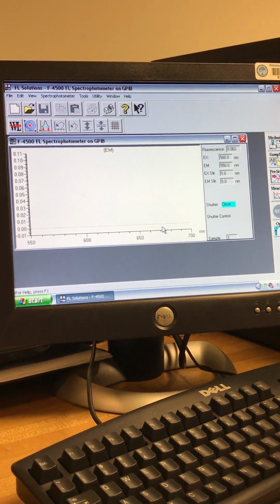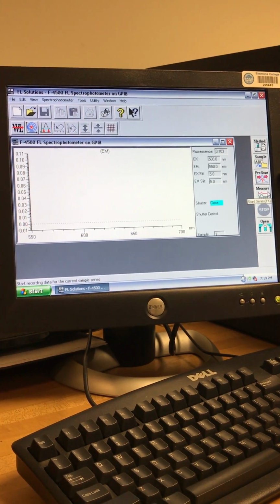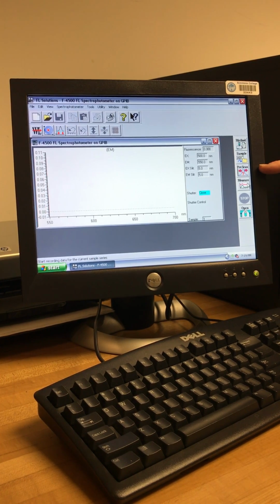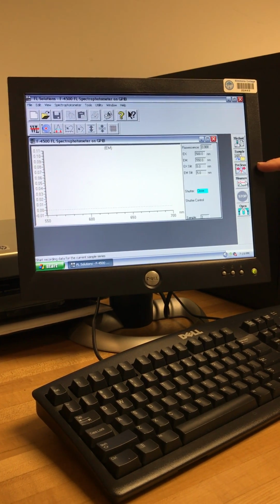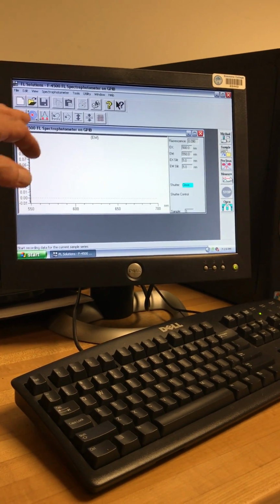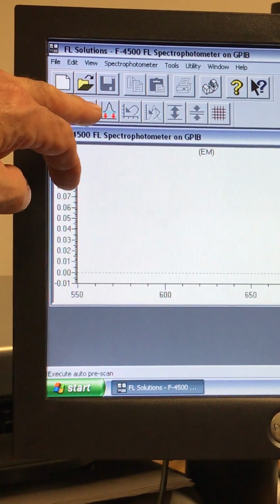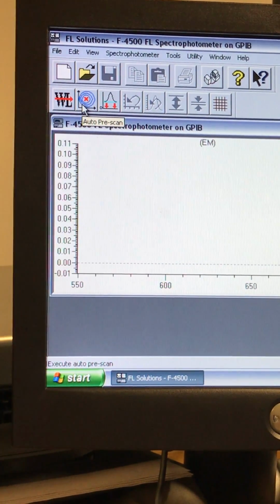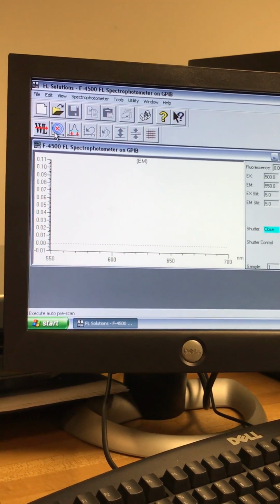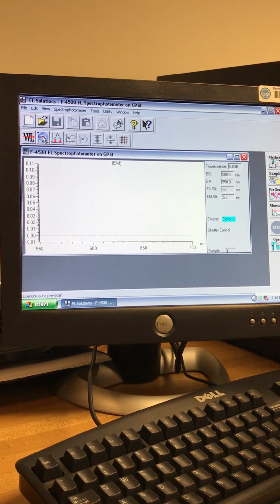And as far as I know, I don't know what the pre-scan function is for. Pre-scan finds kind of the optimum point of absorption and emission. Kind of just sets it that way. Oh, I see. Okay. I've never had that before. Why don't you put the pointer there? Let's see what it says. Auto pre-scan? That's the same thing. It finds the sweet spot. Got it. But we know what the sweet spot is. Yeah, Selena probably did all that pre-work for us because her thesis already gave us these values here.